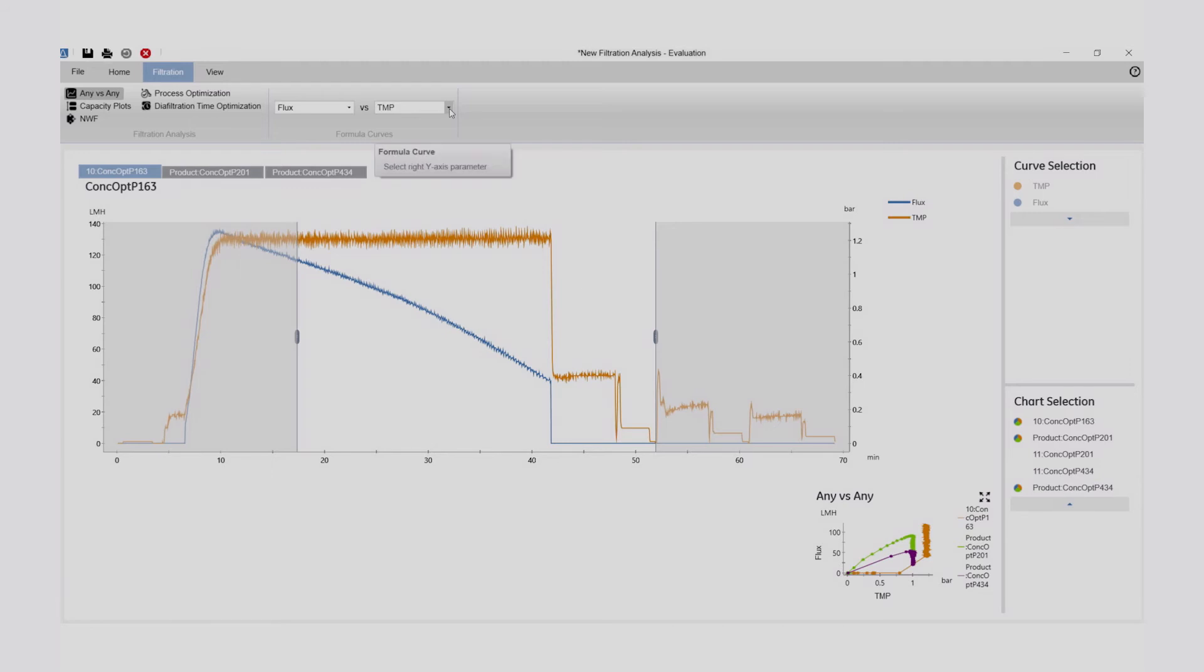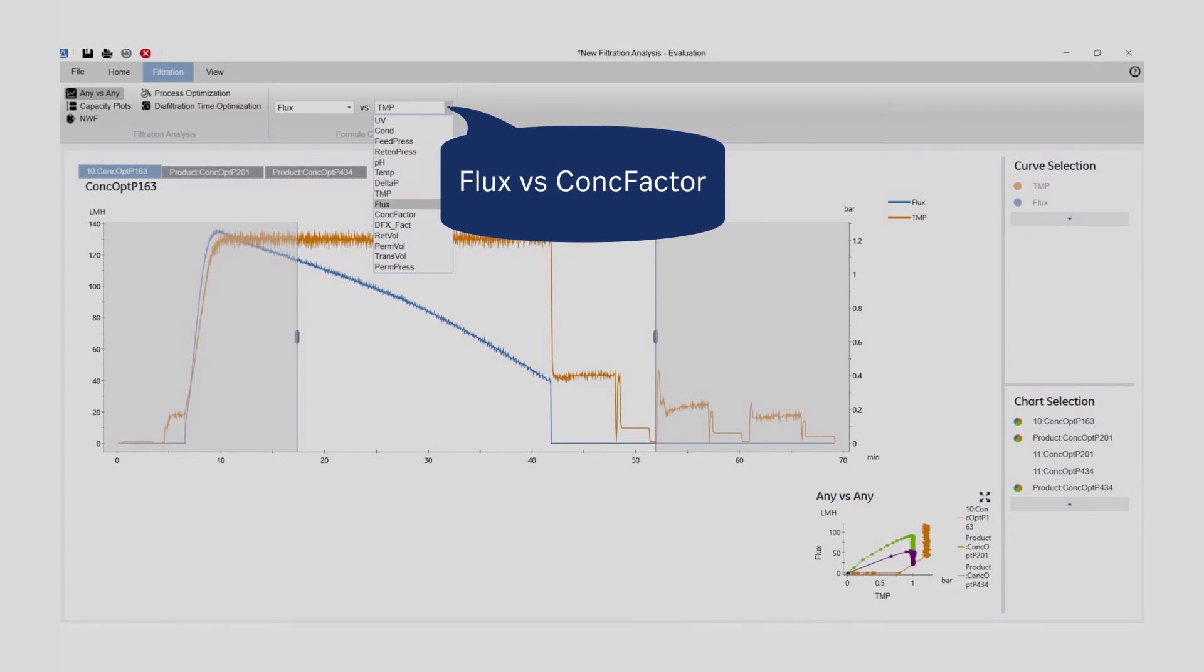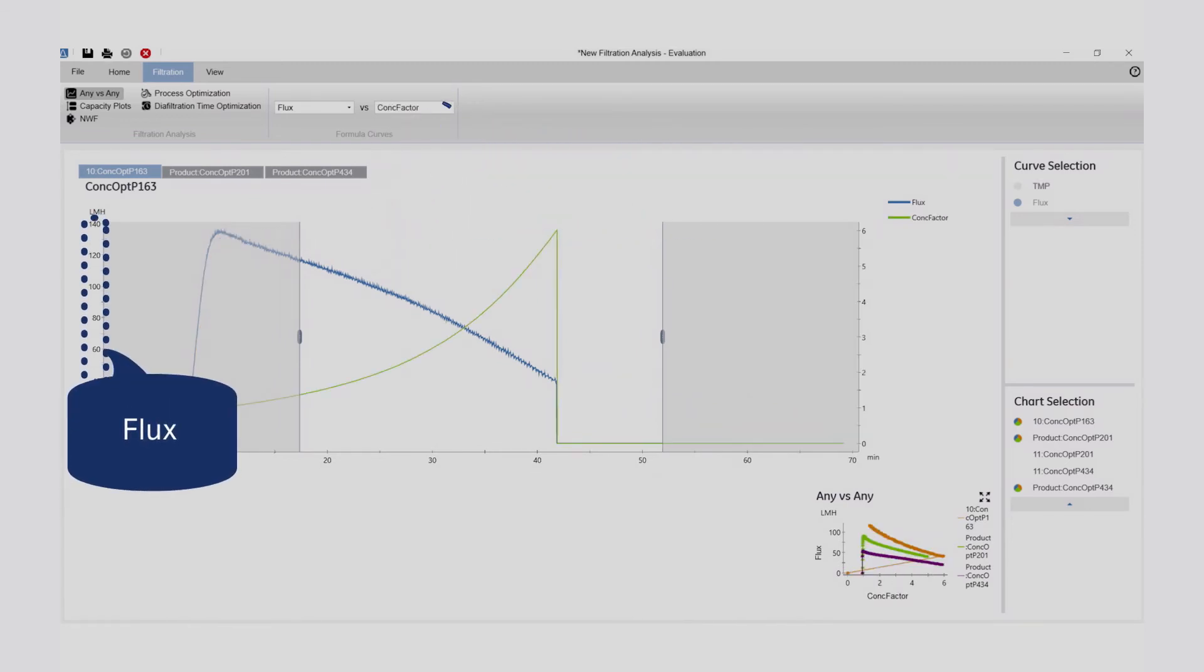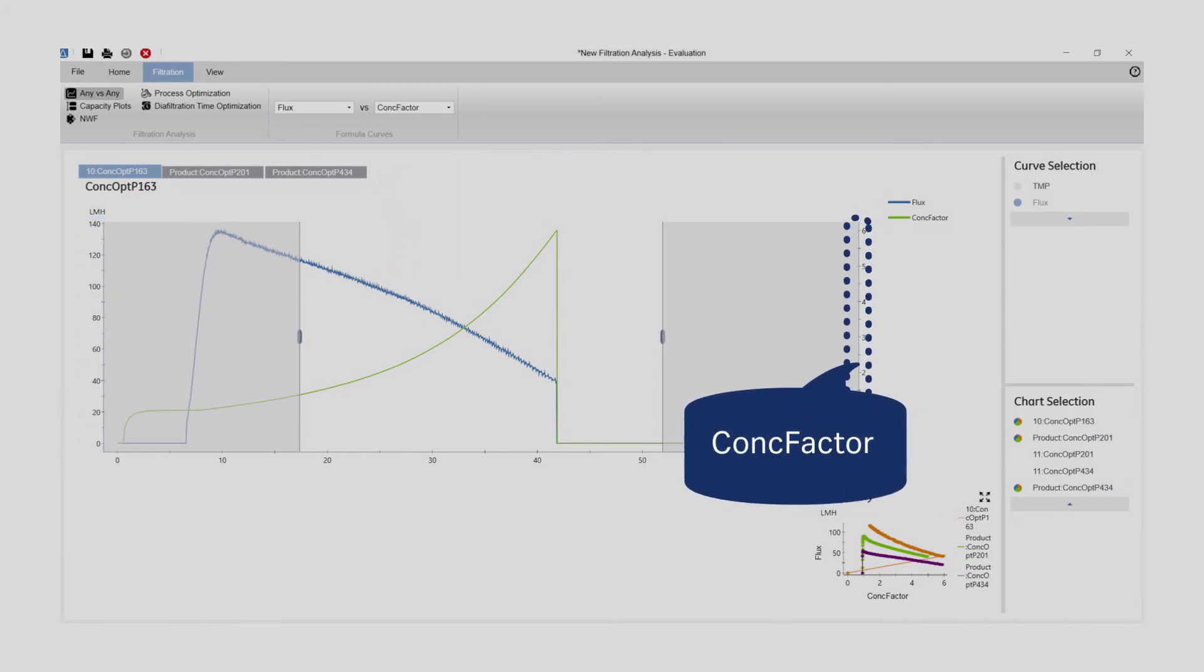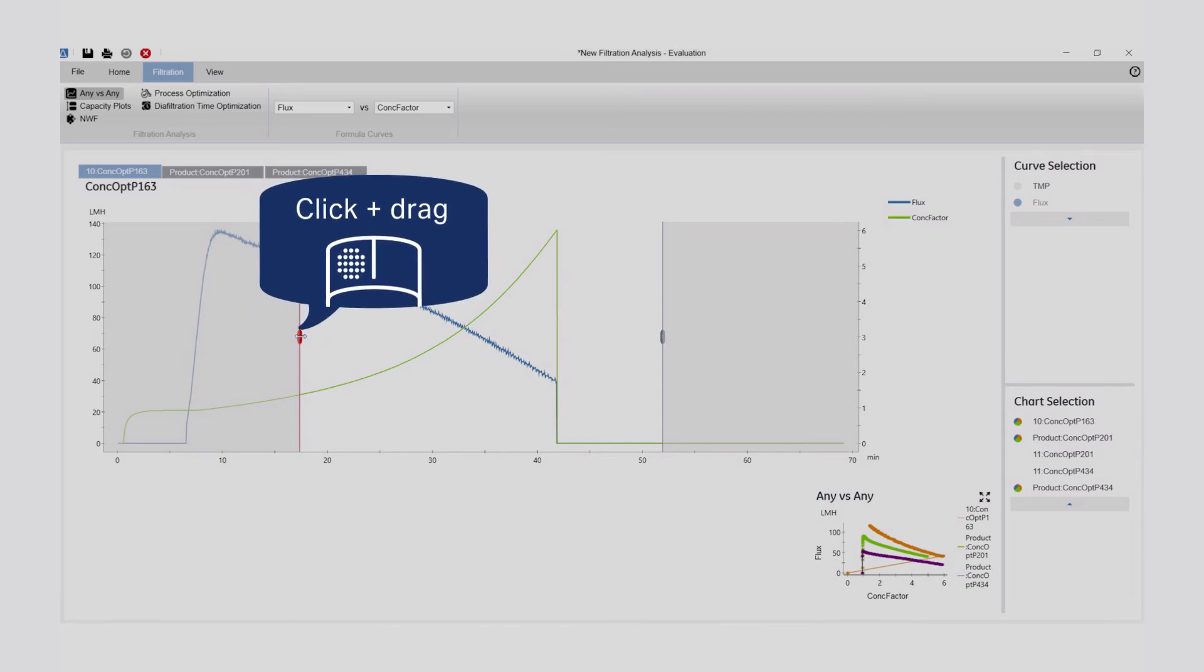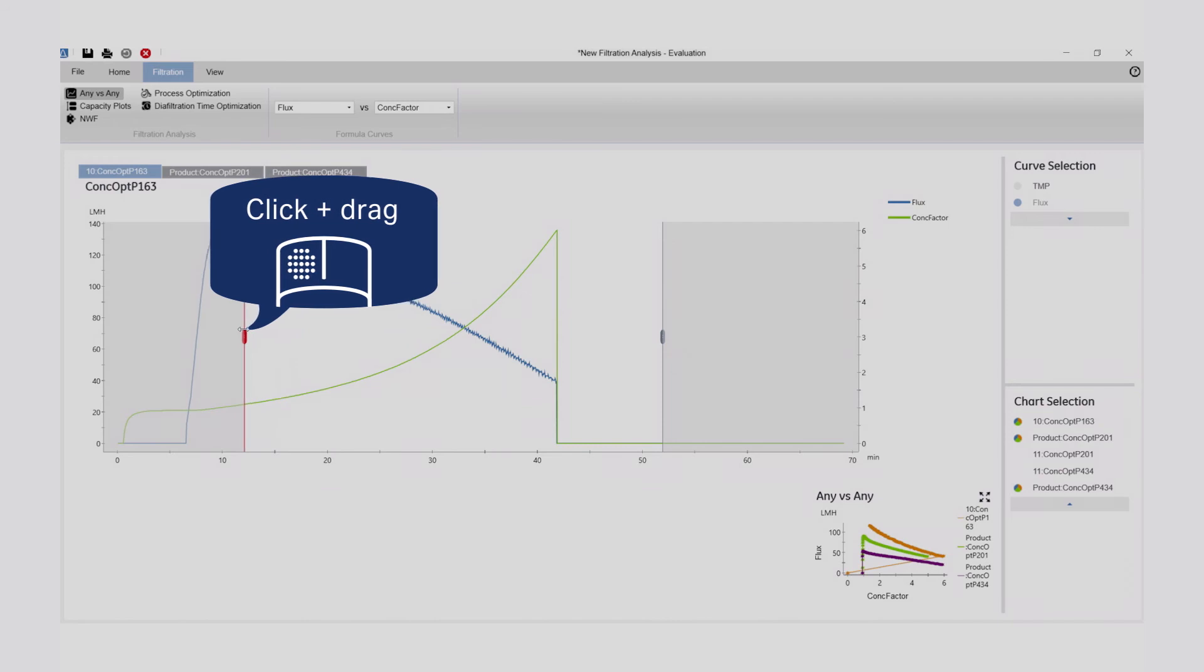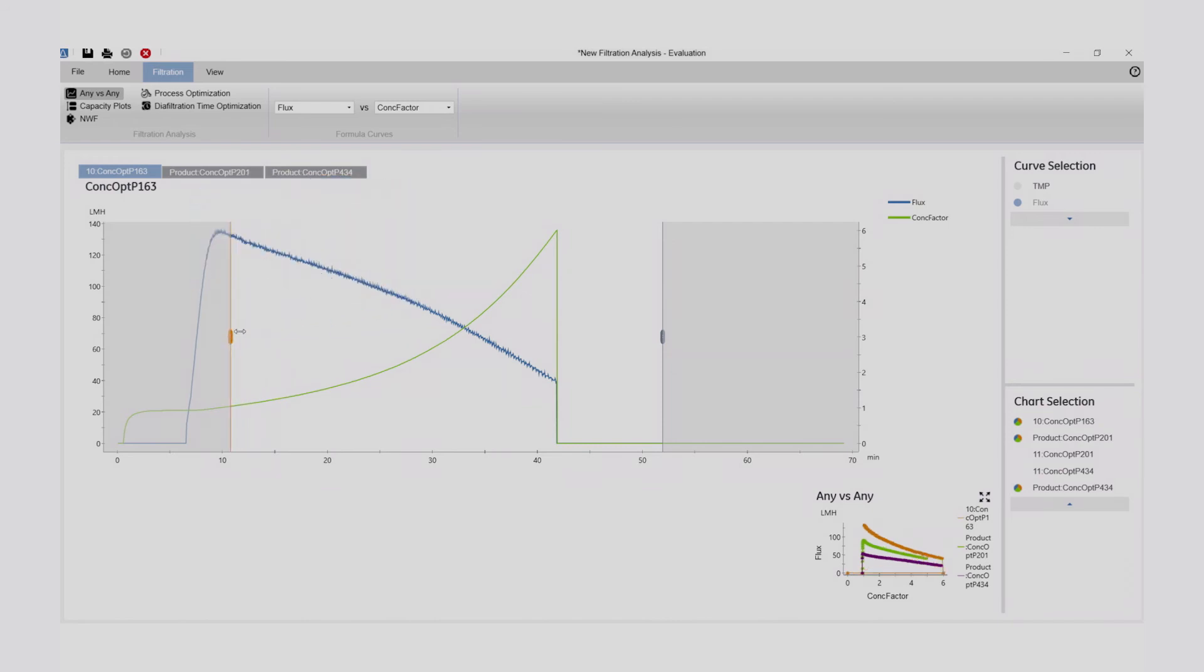Select the curves you wish to analyze. In this case, we want to compare flux vs. concentration factor. Flux is plotted on the left y-axis, and concentration factor is plotted on the right y-axis, against time. By dragging the selection windows, you can select the area to be analyzed from each plot.